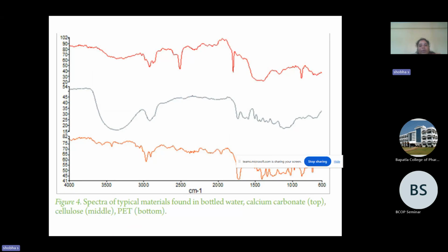And one more important thing in the IR spectrum is the software we are using, generally Opus or any software linked to the IR. In that software, we give some commands. From that, we can correlate whatever compound or excipient, and superimpose them at a time. At least up to 10 compounds we can superimpose and compare the results, to see the difference in between and among them. That will be possible with this IR spectrum. From that also we get clarity about what the initial product is and what the final product is, or whatever is happening in between.